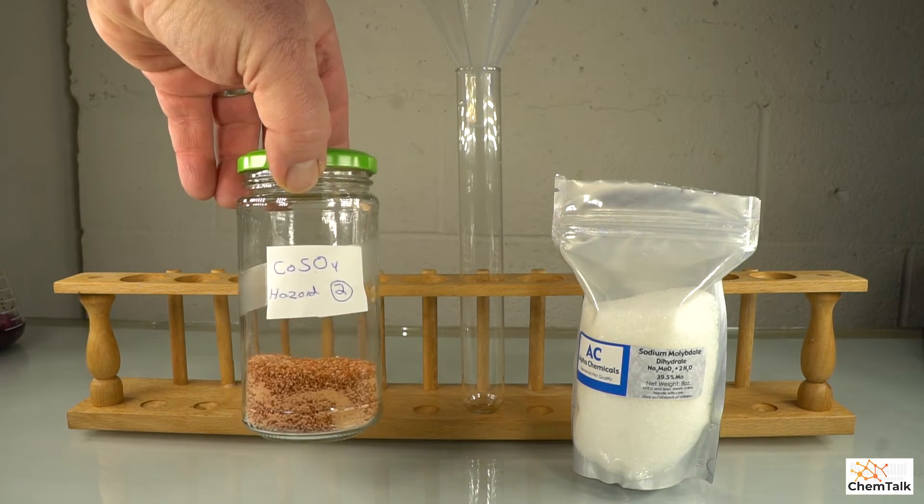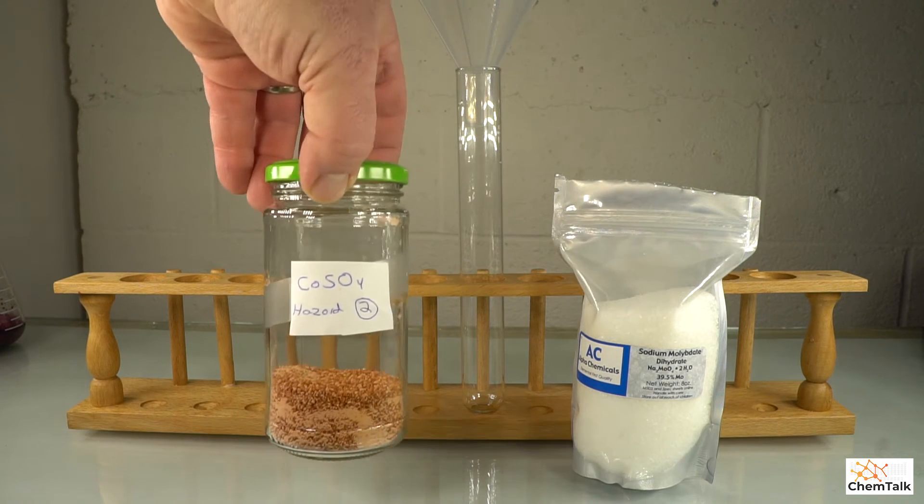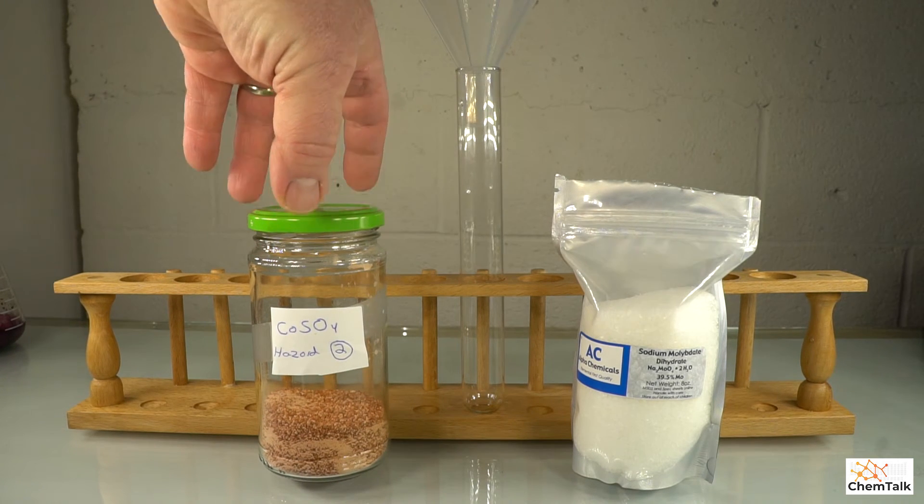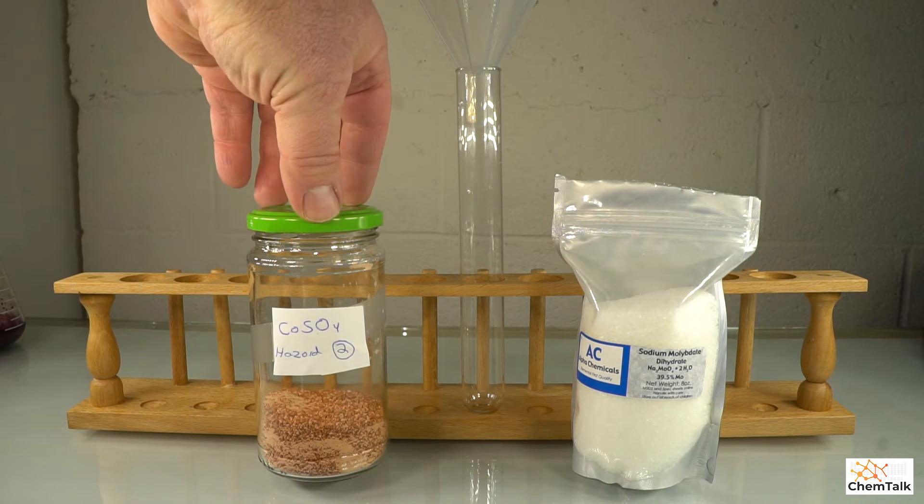And here is some cobalt 2 sulfate, and it's a really nice pinkish red compound. And the thing about cobalt is that it forms complexes with water that can be blue or red, depending on the pH of the solution.